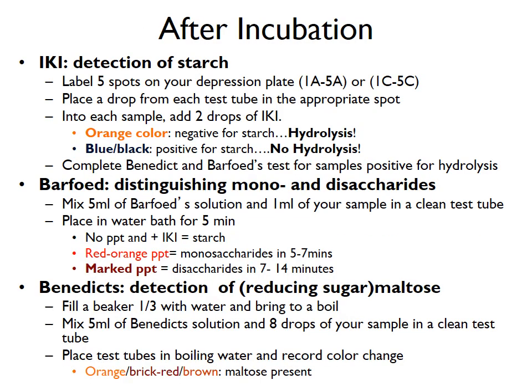All right, so after incubation, what we're supposed to do next is to test for the digestion of carbohydrates. So we're supposed to do 3 tests for this purpose, to determine if we still have carbohydrates in our samples and the type of carbohydrate that we have. So the first one is called the potassium iodide test, IKI, and what you're trying to do is to detect starch. If you have starch, it means that there's no hydrolysis, and if you don't have starch in there, it means that there is hydrolysis.